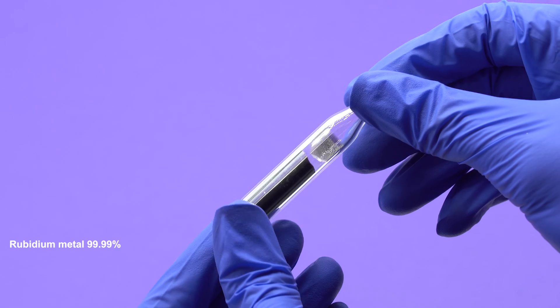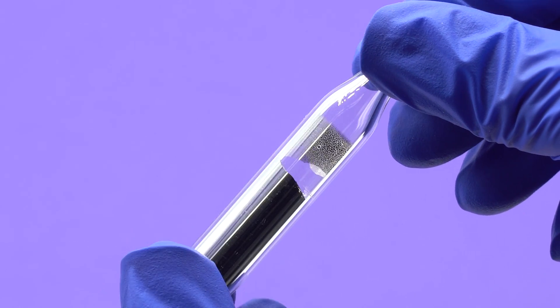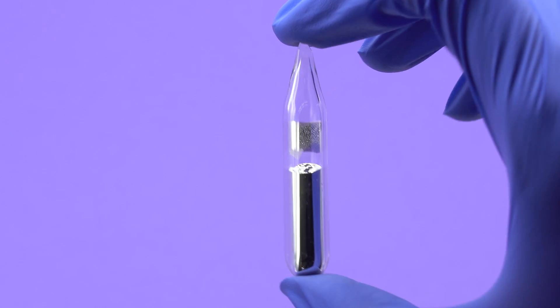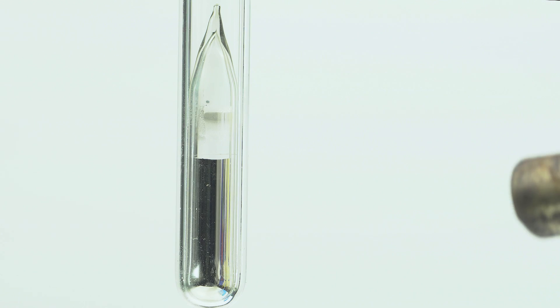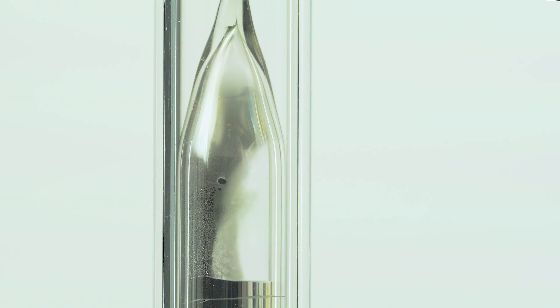Okay guys, take a look at this ampule containing 2 grams of pure metal rubidium. Before I crush it, I want you to see it boiling, forming thousands of tiny drops of liquid rubidium. Due to the low pressure of the ampule, it doesn't need to be heated to 700 degrees Celsius, which is the boiling point of rubidium under normal conditions.